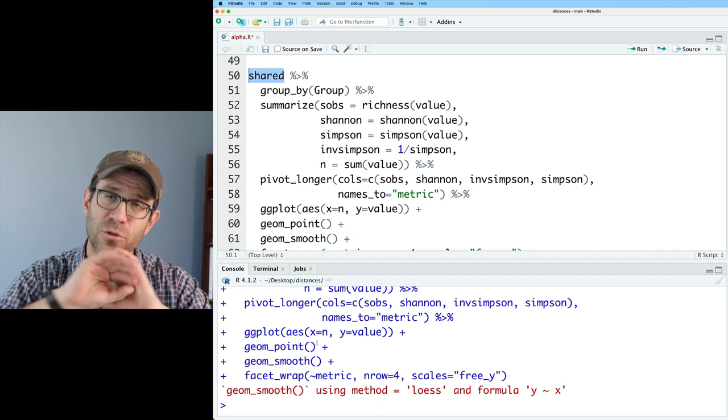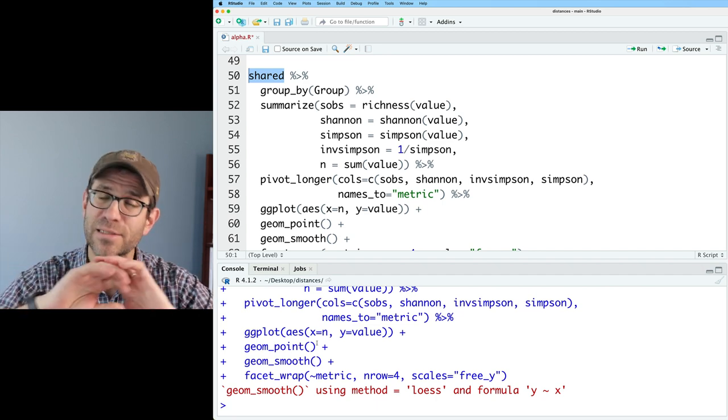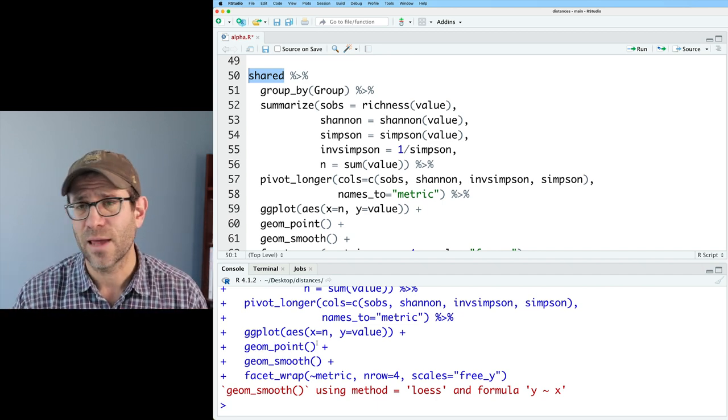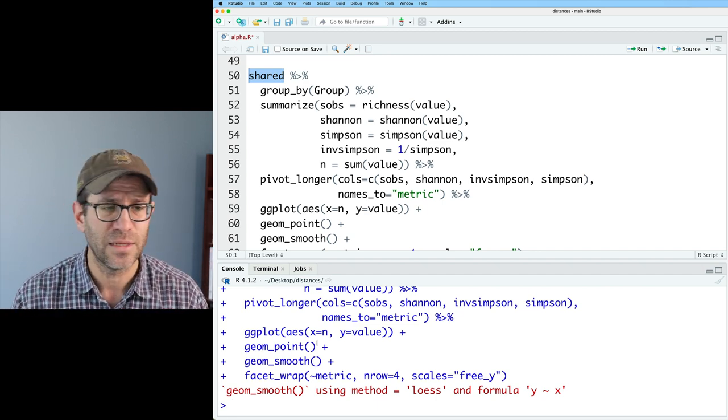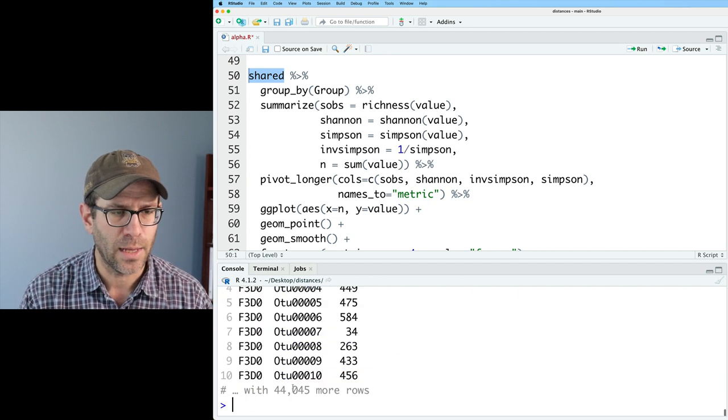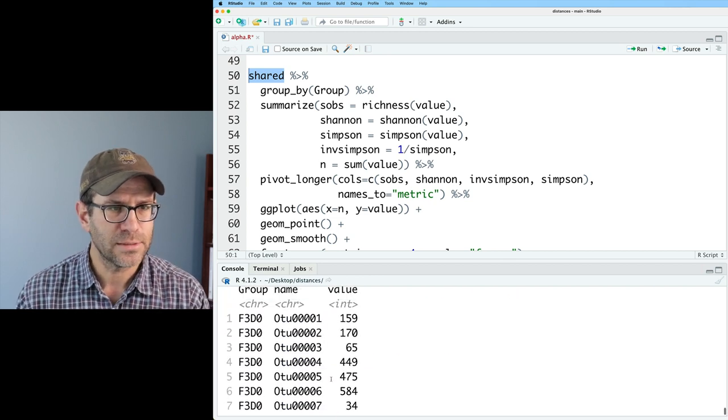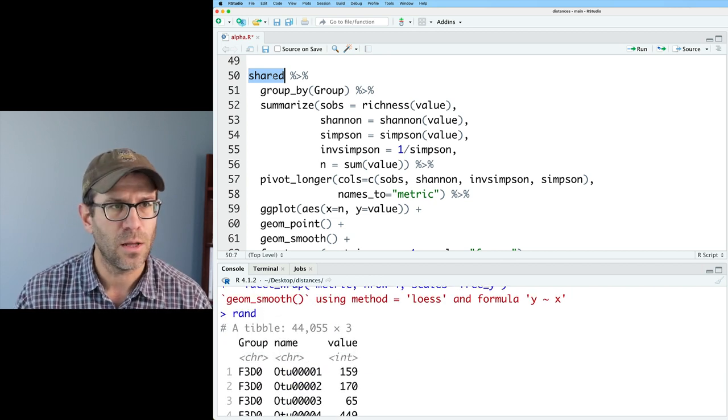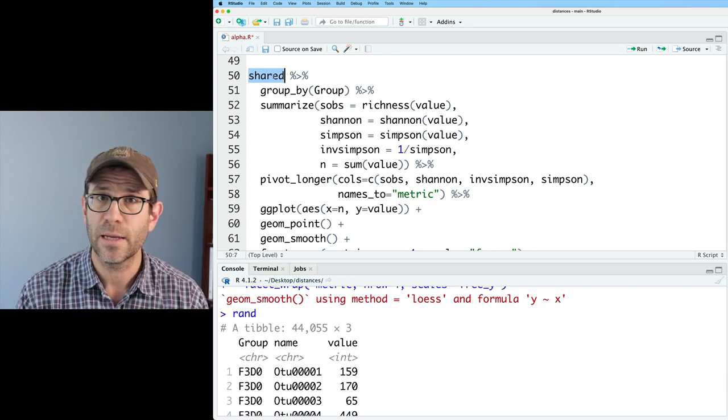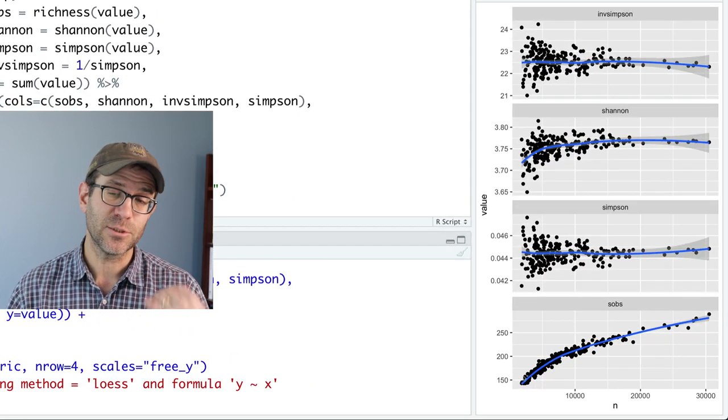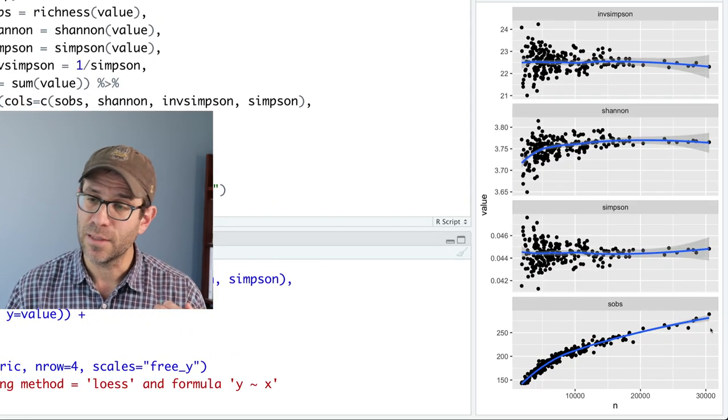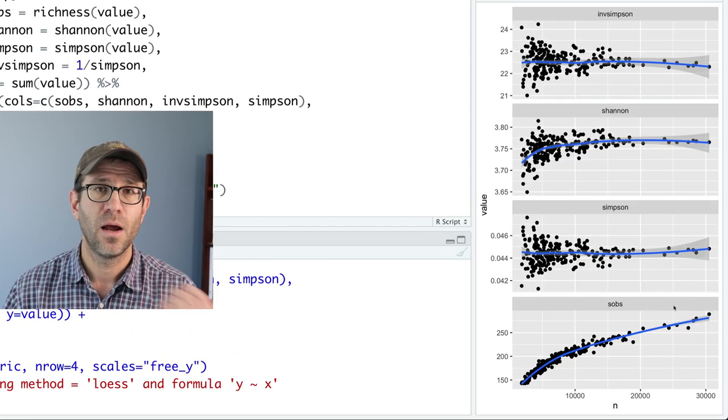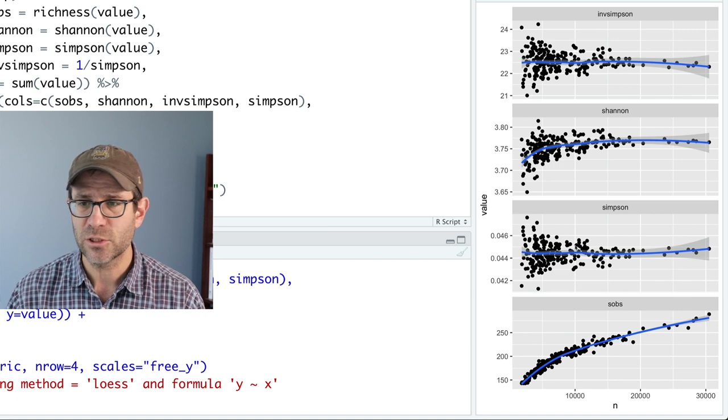And so those should all give us more or less the same value for these different indices. And so if we look at RAND, we again see the same three columns. So I'll just plug in RAND here. And so now we see much more clearly the effect of sampling effort on the observed richness.